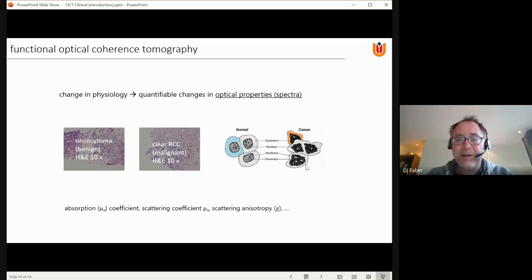This is just a small section, but you see the very different appearance in where the nuclei are, the black dots, and how the density of the coloration is, which relates to cell membranes. So there's a lot of difference over there.